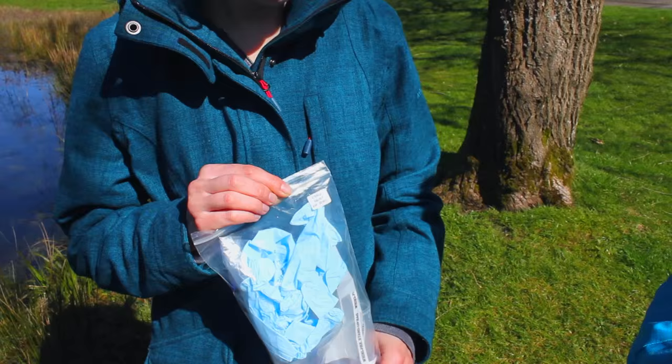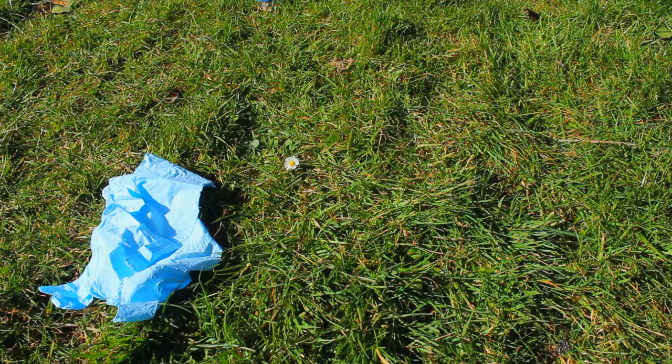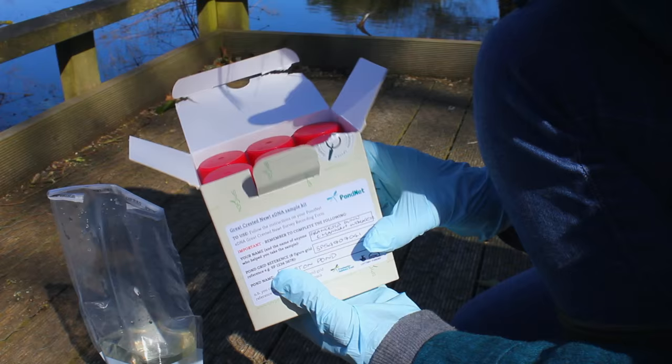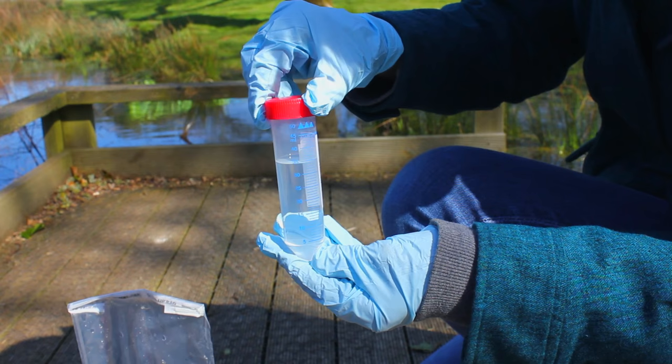To do both the eDNA sample and the pond habitat survey form will take about an hour. In the eDNA kit you will find two pairs of sterile gloves, a sterile 30 milliliter ladle, a sterile 1 litre Whirlpack bag, a sterile 10 milliliter pipette and a box containing six sterile 15 milliliter tubes, two-thirds full of alcohol preserving fluid. Please use a fresh kit for every pond you sample to avoid cross-contamination.